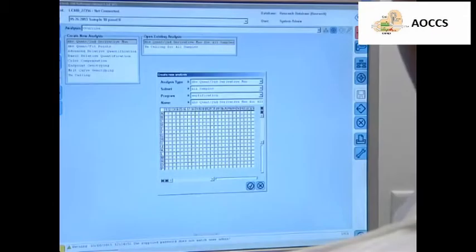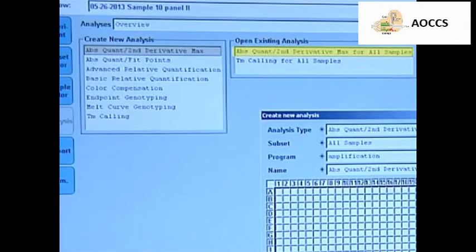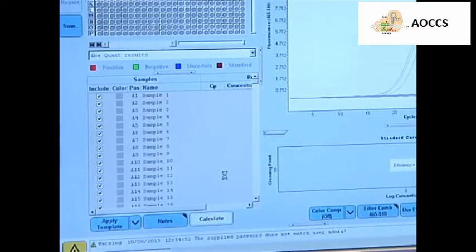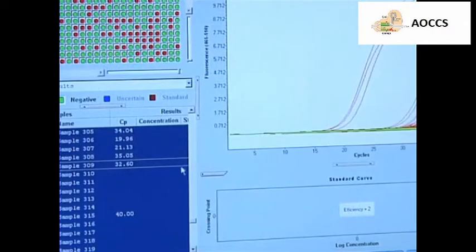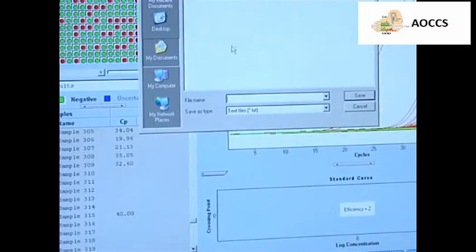To begin analysis, select the second derivative analysis method in the Roche lightcycler. Then, calculate the quantification cycle, or CQ values. Export the data as a table, and save it as a text file.